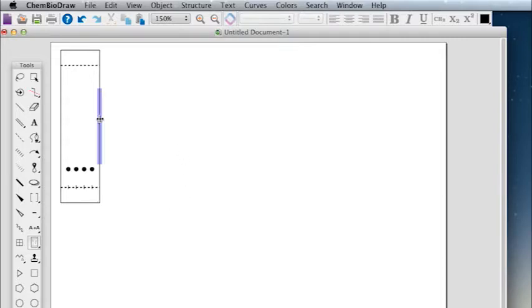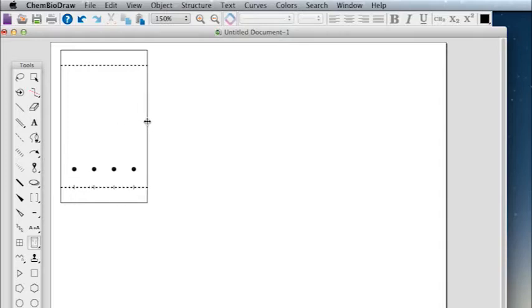Changing the dimensions of the plate now will not increase the number of lanes, but it will just increase the width of the plate. If you decide at a later time that you need another lane, place your cursor at the starting line until you see a blue box.